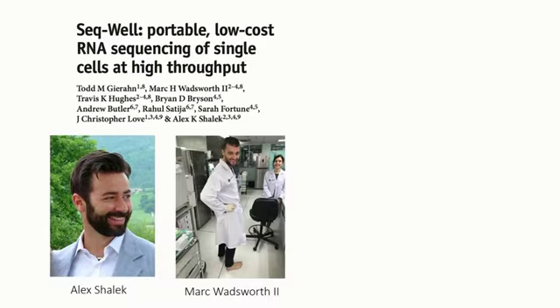But what we want to do next, in parallel with all the analysis that we are currently doing with the bulk transcriptome, is that in our laboratory, now in collaboration with Alex Shalek at MIT and Dr. Yetsum at McGill University, we are also pursuing single-cell transcriptome of the parasites using Seq-Well. By doing that, there are two main advantages compared to the bulk transcriptome: we could attempt to capture the potential heterogeneity of these hypnozoites, and also, importantly, the response of the hepatocytes to the distinct liver stage. So it's going to be a dual transcriptome of the parasites and the hepatocytes.